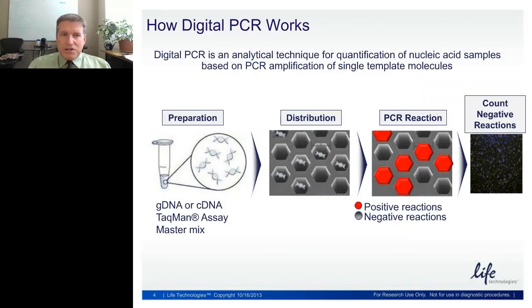So the way that digital PCR works is that you start off by setting up a regular PCR reaction in a tube.